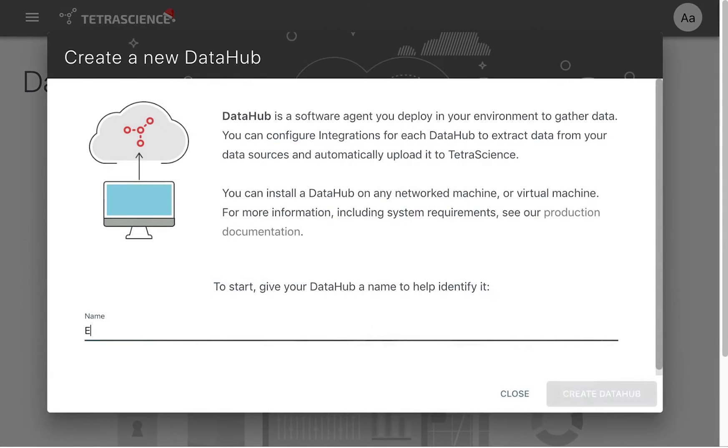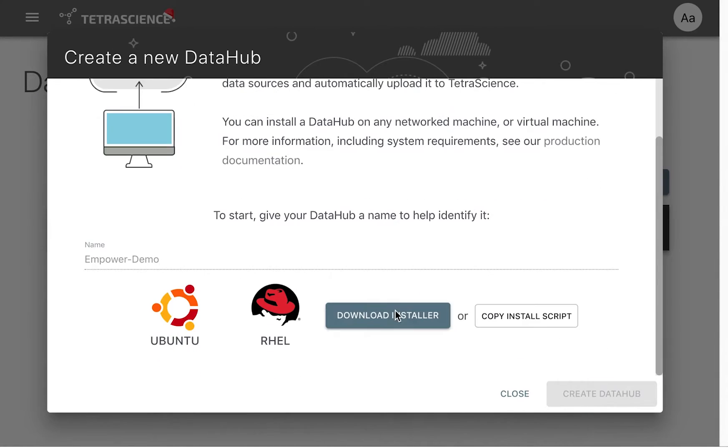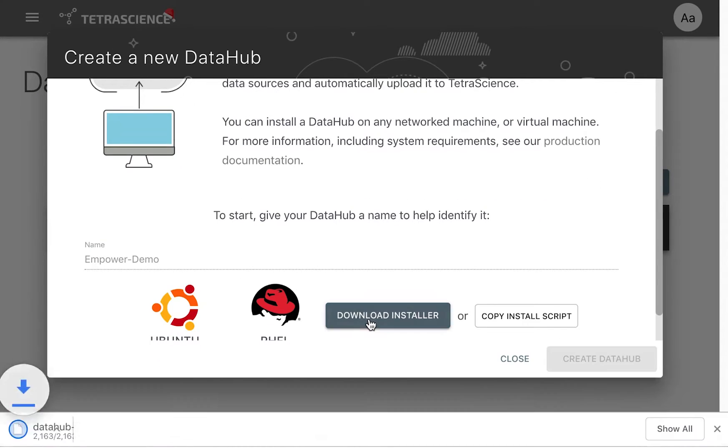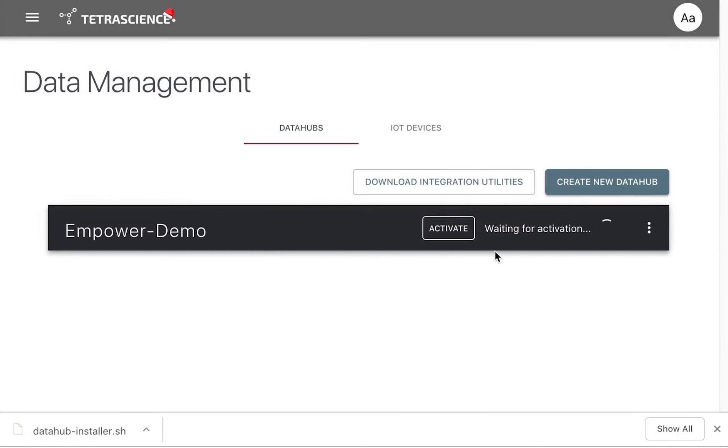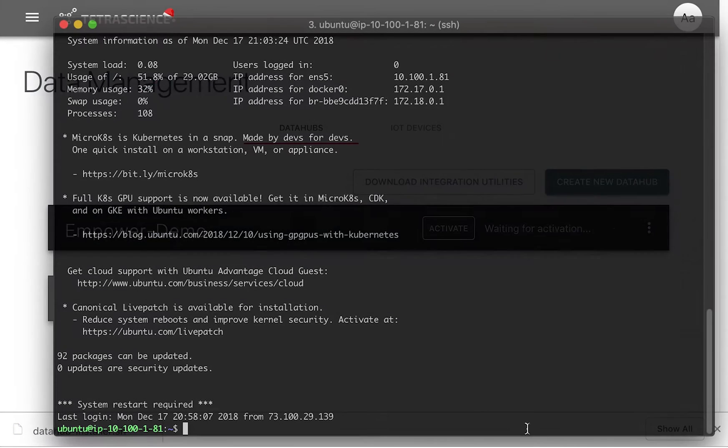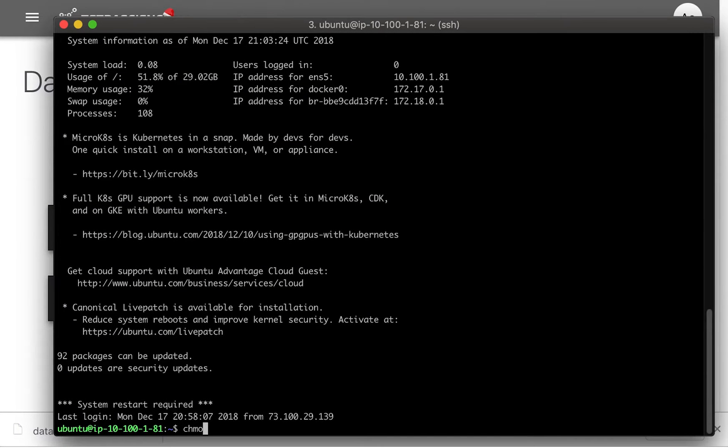It's easy to set up a Data Hub connection. Here, we are on the Data Management page within TetraScience. We'll name our Data Hub and download the installer. The installer is a batch script file.